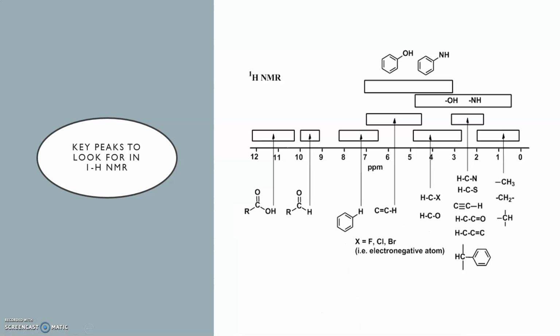So here we are again looking for conformation of that aromatic ring. We're going to look for conformation of a potential aldehyde, and if there is no peak, we will confirm that it is a ketone, because ketones do not have any hydrogens as part of it, therefore will not have a significant peak in this spectrum. Another thing we'll be able to tell and confirm is the CH3 and CH2 groups and how they are connected in the compound.